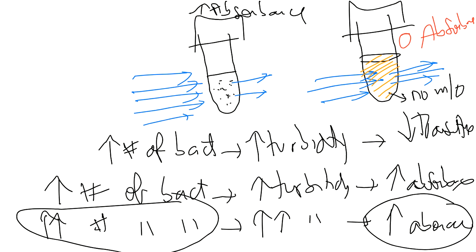This is the equivalent in some ways when you weigh something and you have to zero the machine against the weight of the container. So you have to tell the machine, okay, this is the beaker. I'm going to put the stuff that I'm going to weigh inside the beaker, but I need to zero the machine with the beaker on. This is exactly the same principle. That's what we call the calibration. So that's what that question is about. The calibration sets the value of absorption to what? You should know that when there is what? How many bacteria in the medium? Does that make sense? Does that answer your question?